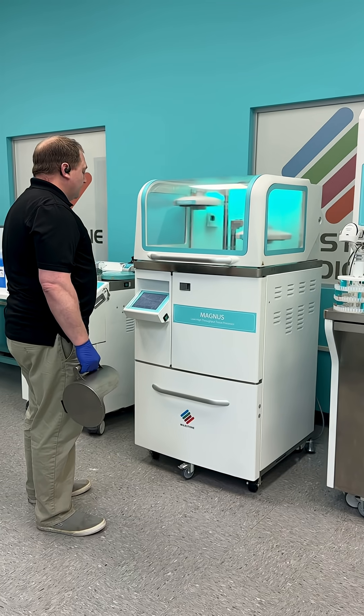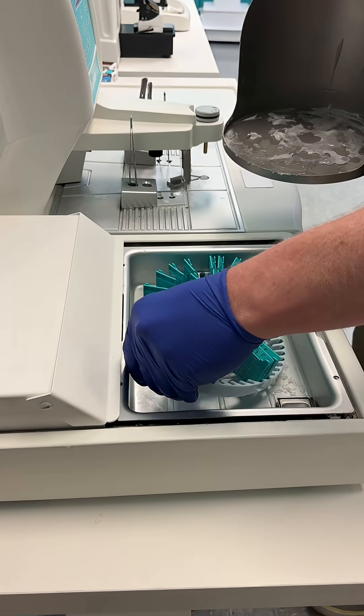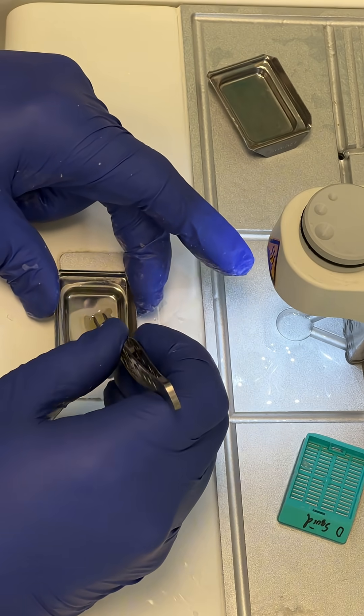But anyway, once we got the specimens into the cassettes, we let them fix overnight, came back the next day, and put them through a xylene-free protocol on our Magnus tissue processor.